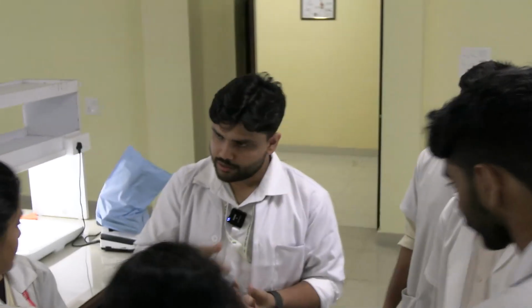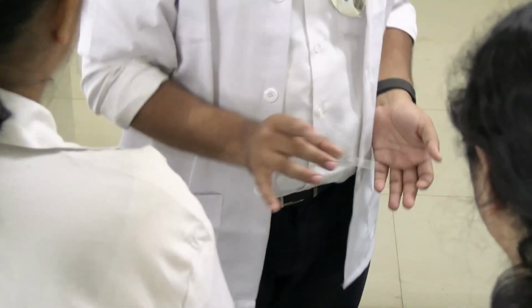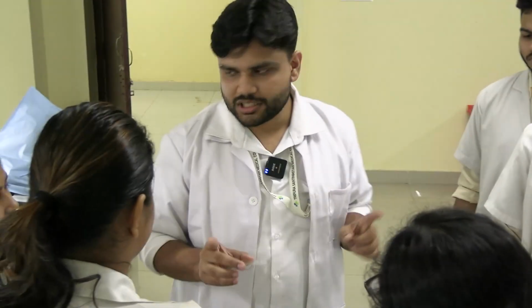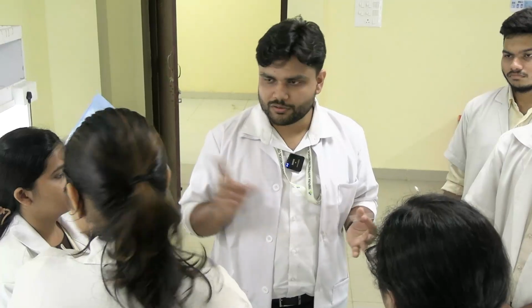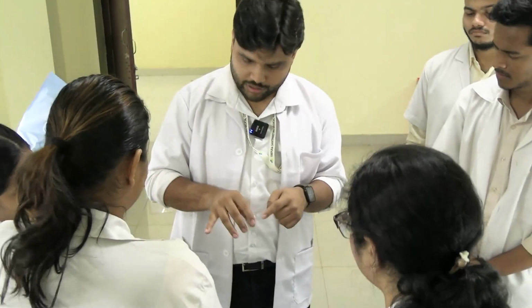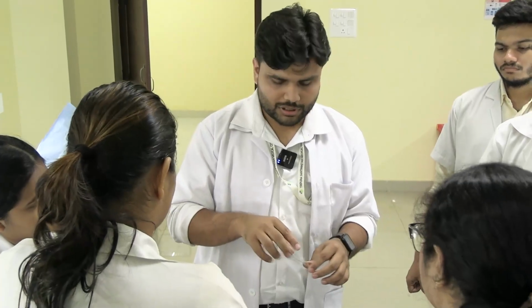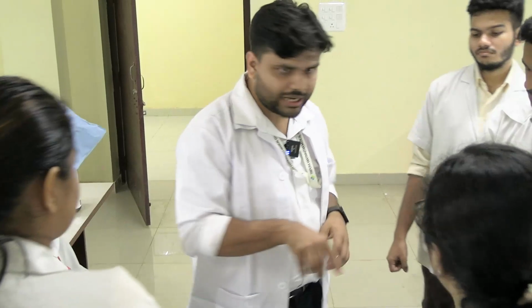Flood the slide with water directly. You're going to hold it like this at an angle, not like this, otherwise the whole smear and the color will come to you. The biggest flex in case of doing a Gram stain is to show that your hands are not dirty. That is the biggest flex, because everyone's hands will be dirty and your hands will be very clean. So remember this, hold it like this and let the water dribble down through your index finger onto the slide. Or alternatively, you can also pour the water at the end of the slide, but this is going to be a bit difficult for you. So you're going to do it like this, holding it at an angle.